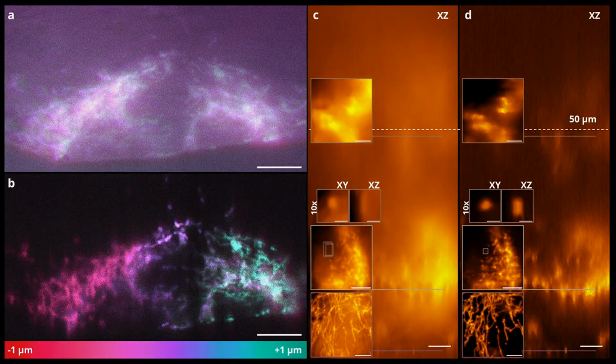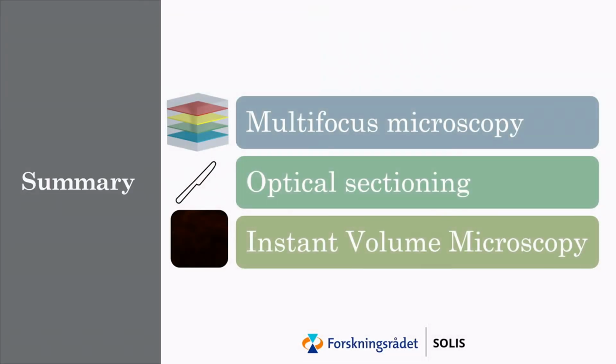Okay, and with that, I want to wrap up. So I told you about multifocus microscopy, optical sectioning, and how we combine the two to have instant volume microscopy.